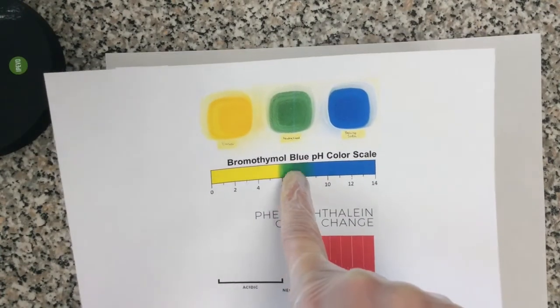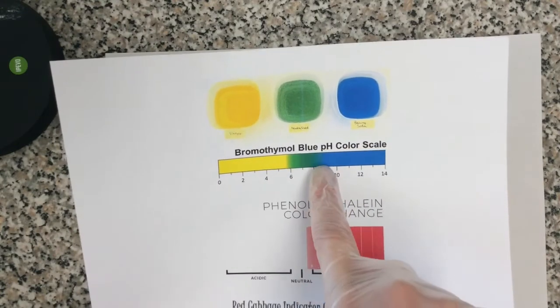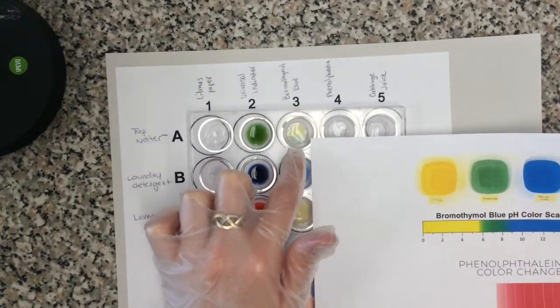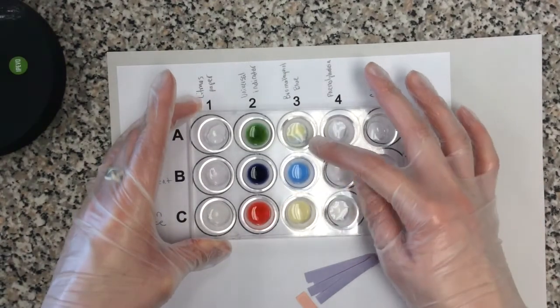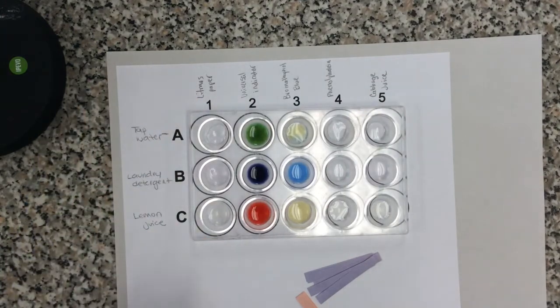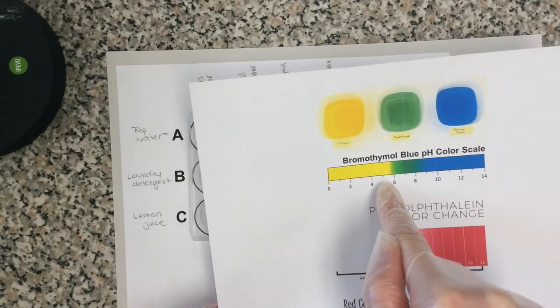And if it's neutral, it's going to be some shade of green or slightly acidic or slightly basic. So if I look here, this one is yellow. Sorry, the blue's kind of reflecting off of it, but it is yellow. Okay, so that would mean that it's acidic. It's some type of acidity level from 0 to about 5.5.